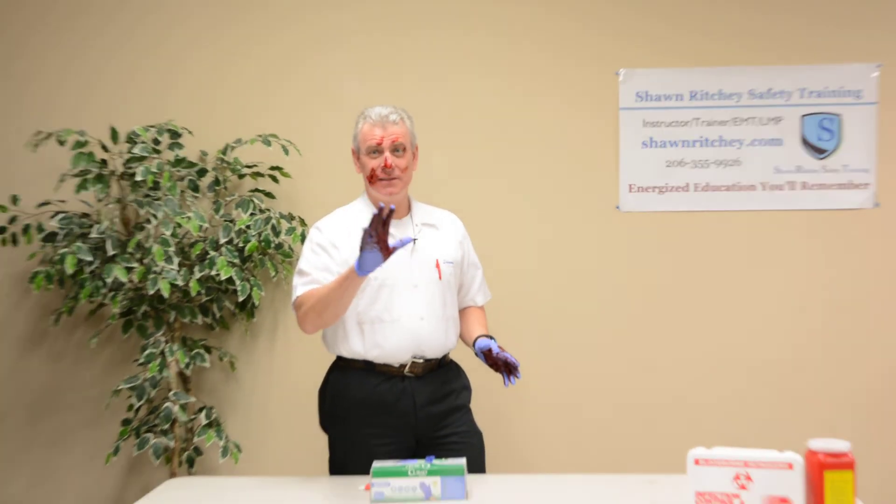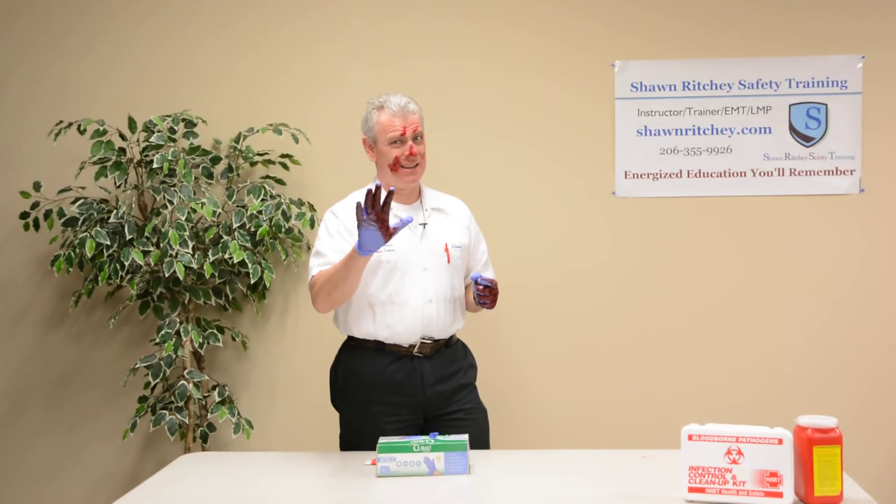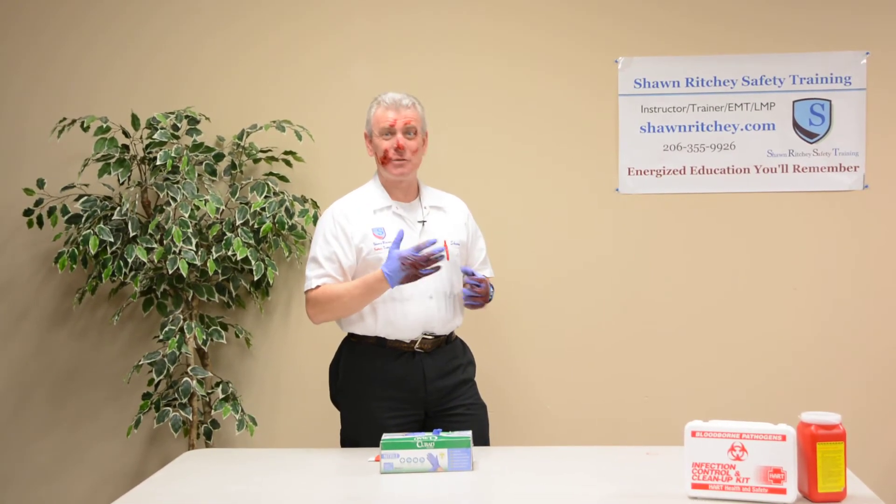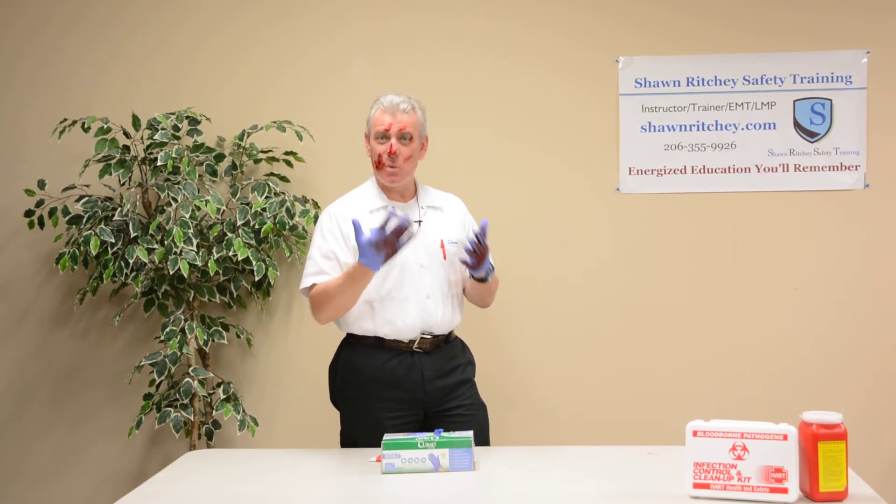It's important to wear gloves, but it's more important to be aware that there's nothing magical about these gloves. Contaminants don't just stick — you can cross contaminate. So be aware of your surroundings and be aware of what you're doing.